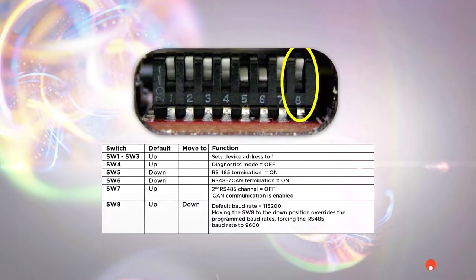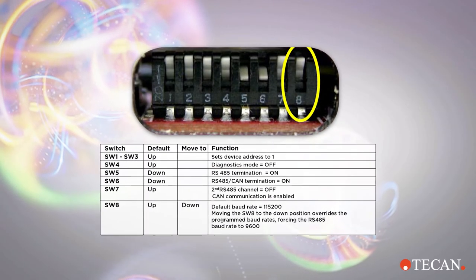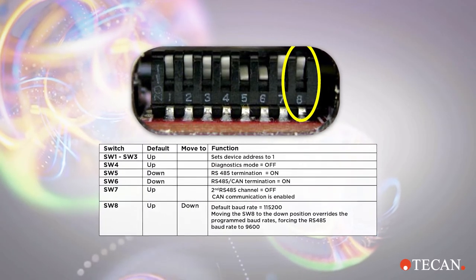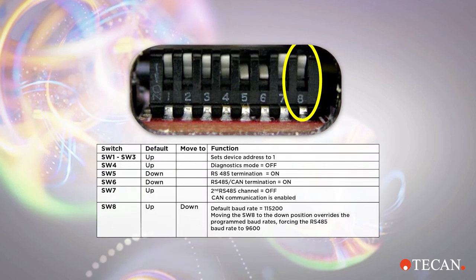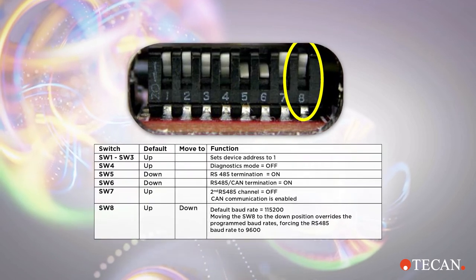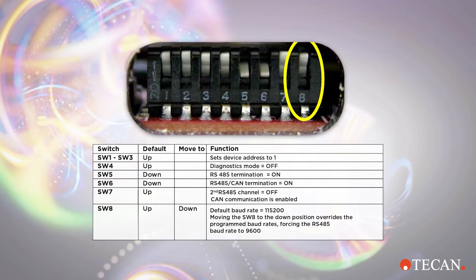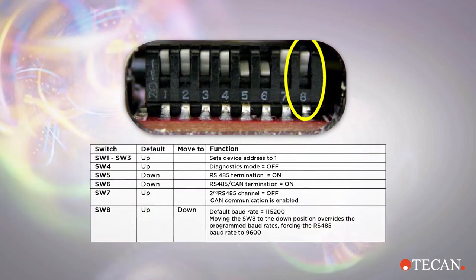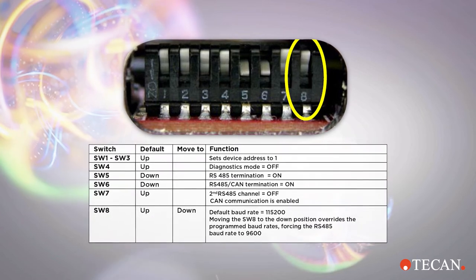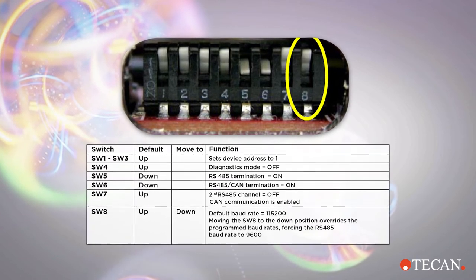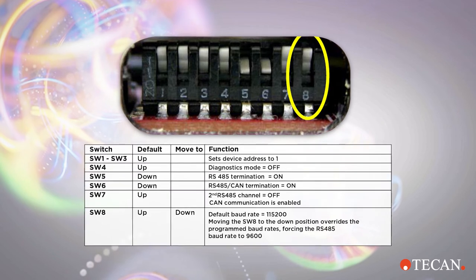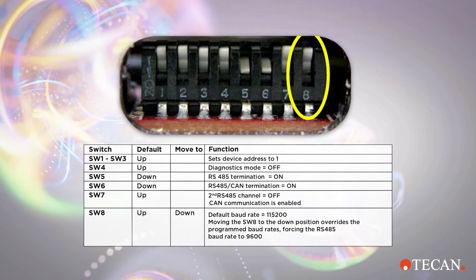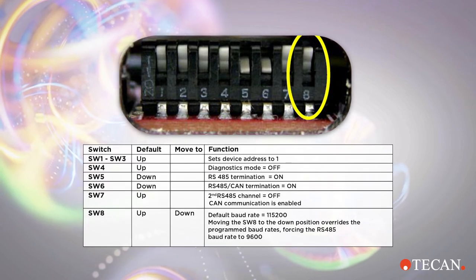First, let's configure your ADP. The ADP communicates via RS-485 serial communication or CAN communication. For this example, we are going to set the ADP dip switches for serial communication at a baud rate or communication speed of 9600. To do this, we only need to change one dip switch setting from its default position.